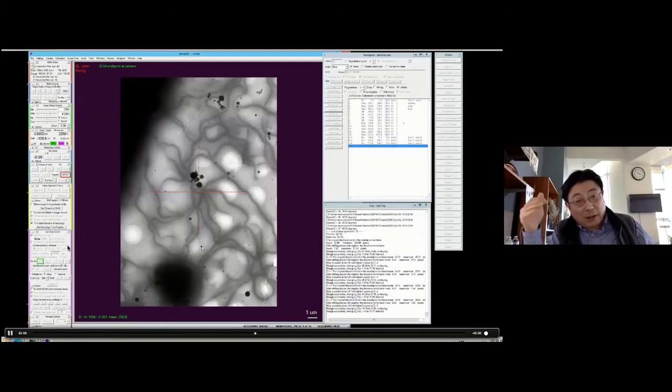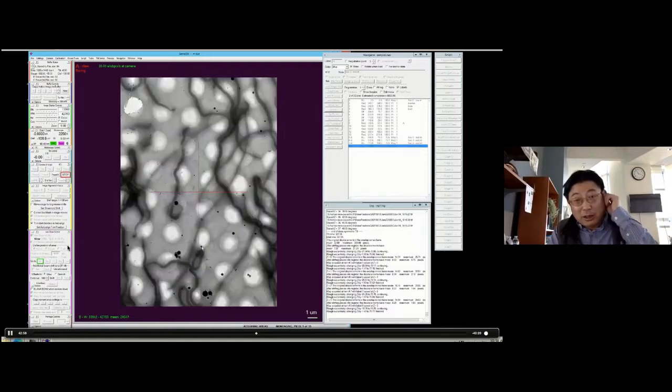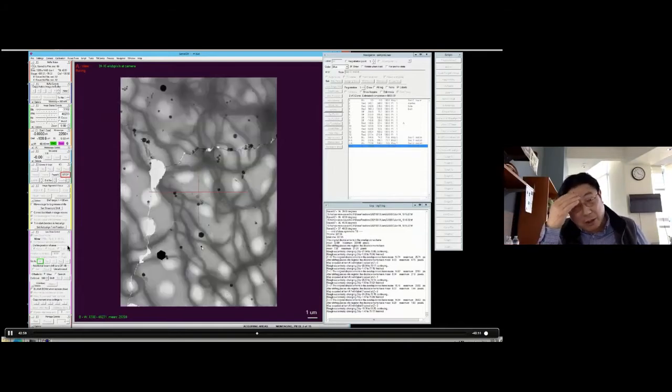If you're not seeing anything after collecting 4 or 5 pictures like this, the chance you're going to see anything is low. So this is a very important step. You want to make sure that you optimize the parameters of the imaging conditions so you actually see something, rather than waiting until the last minute. So if I were you, I would pay attention to this imaging.